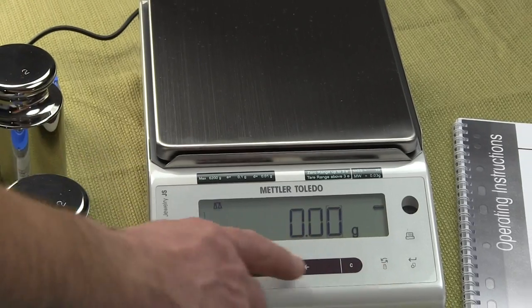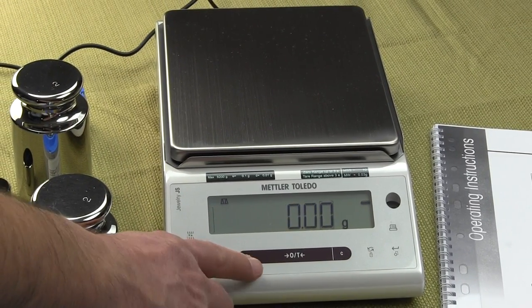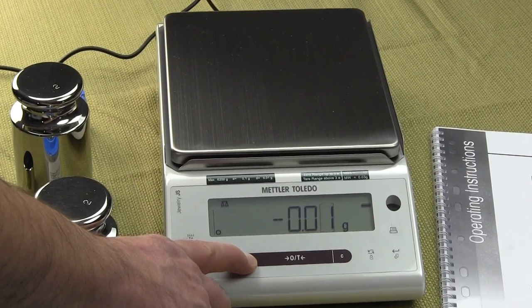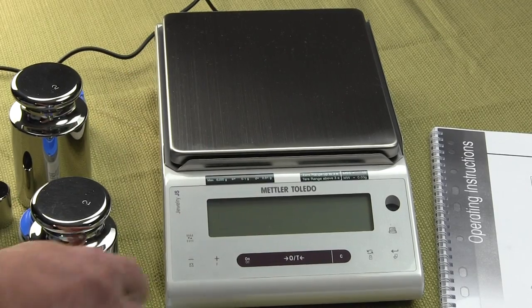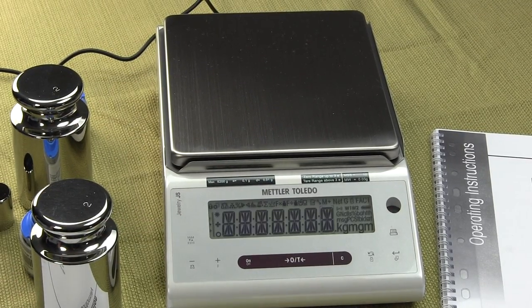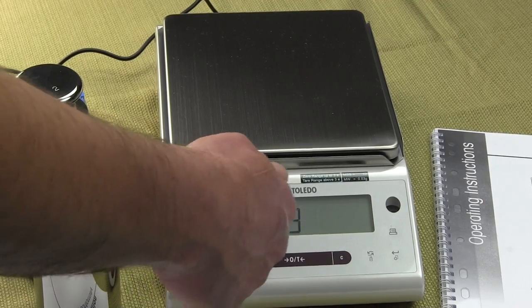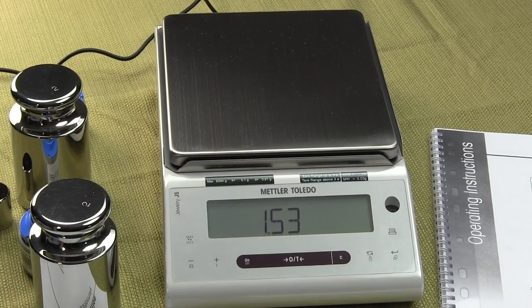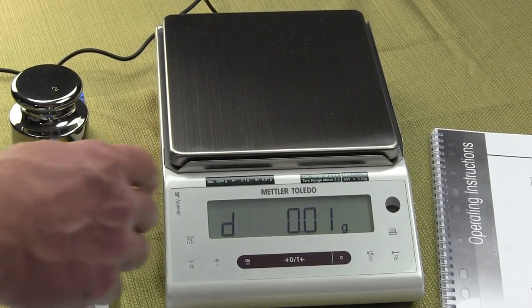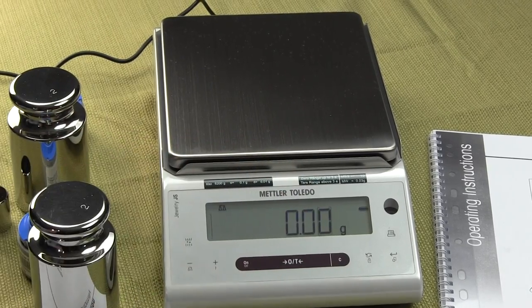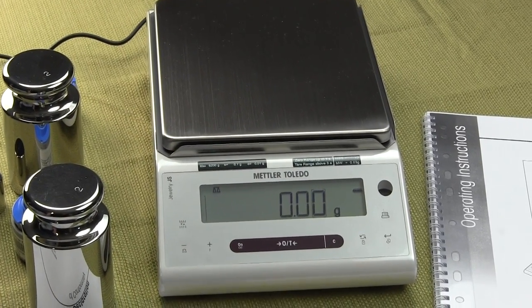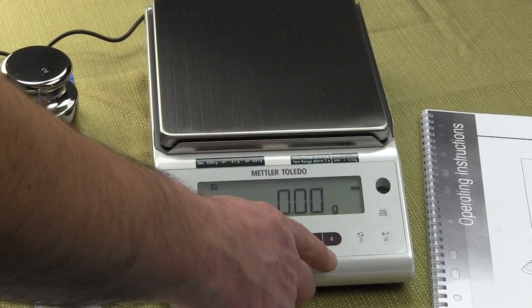This is the on off. If you press this and hold it down, the balance shuts off. Turn it back on. Each time you turn on the balance, it goes through the power up sequence, shows you the software revision that you have, tells you the maximum capacity, also the readability, and then goes to 00. The C is your clear function.